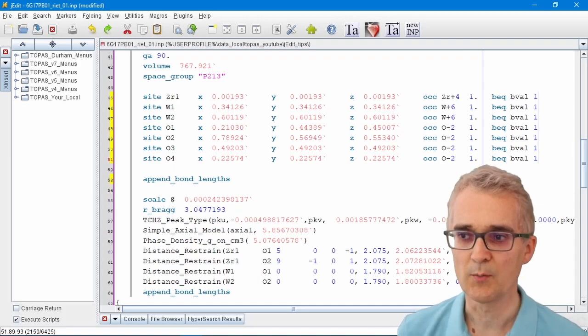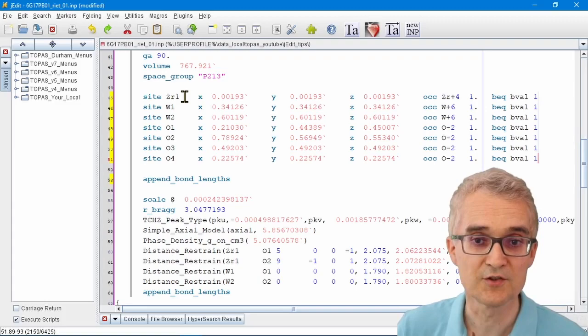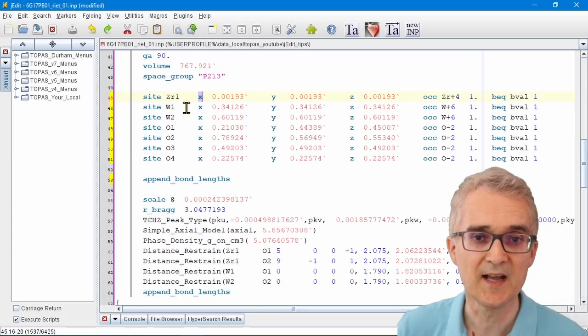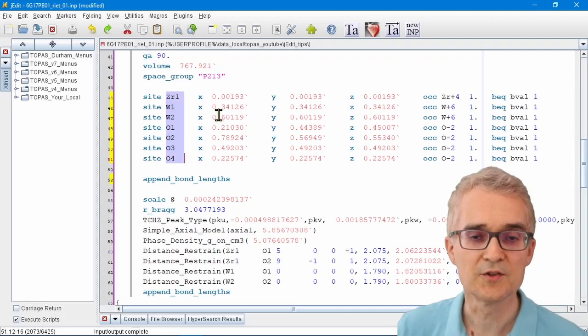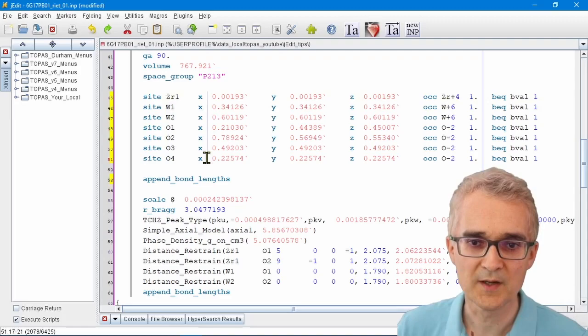You might find you need to set up parameter names for your fractional atomic coordinates. You might want to give each of the x, y, and z coordinates a specific name. To give them a sensible name, I'm going to hold down Ctrl and copy the list of site names.